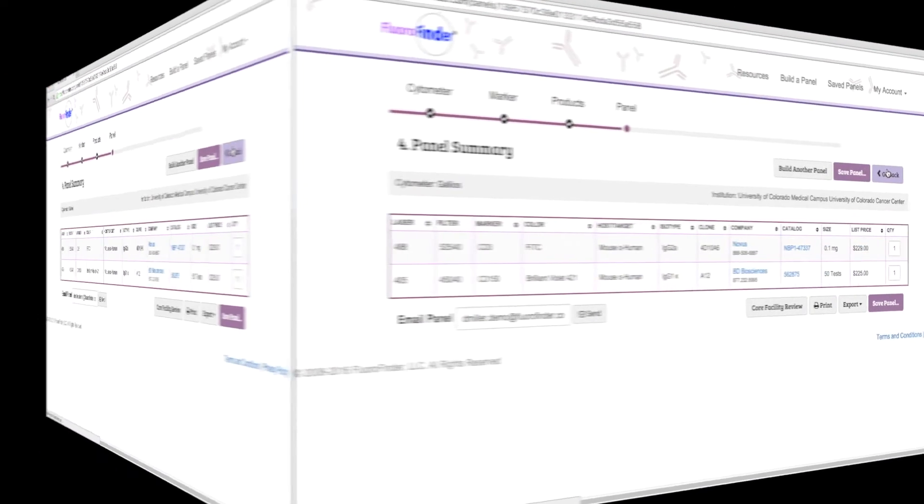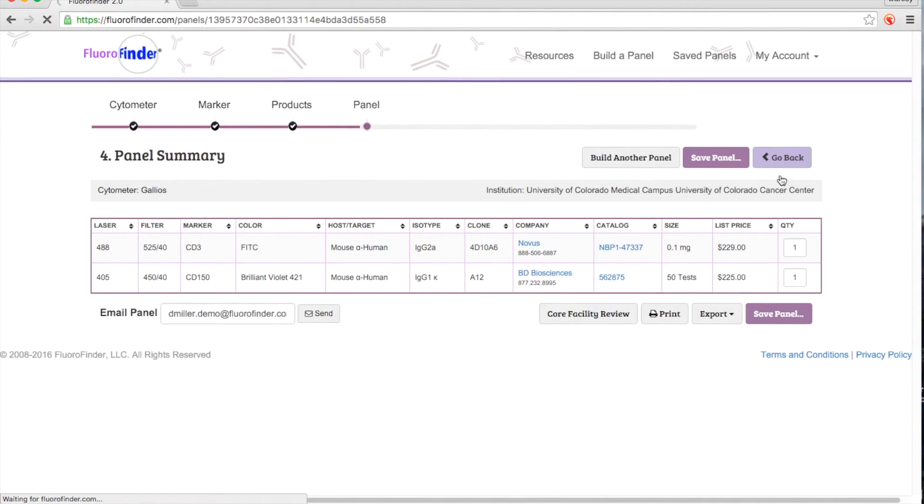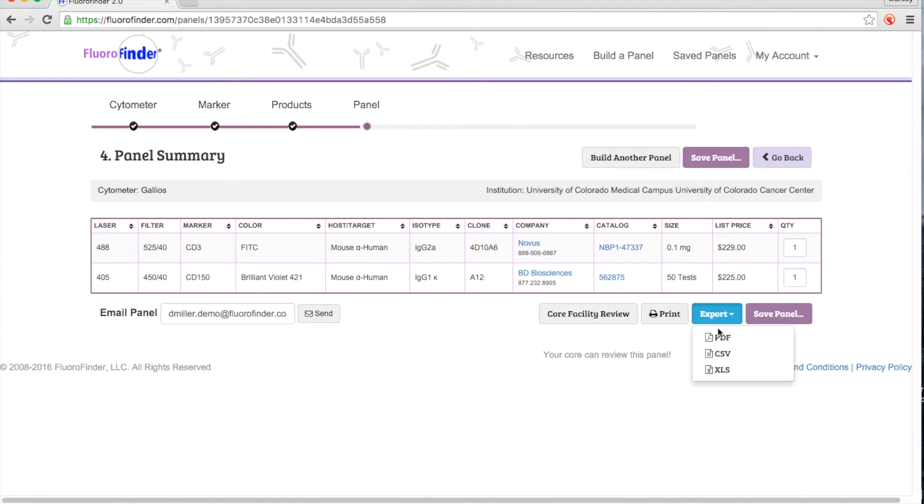Now that you've successfully completed your panel, you can take your list of reagents out of FluoroFinder to place your order.